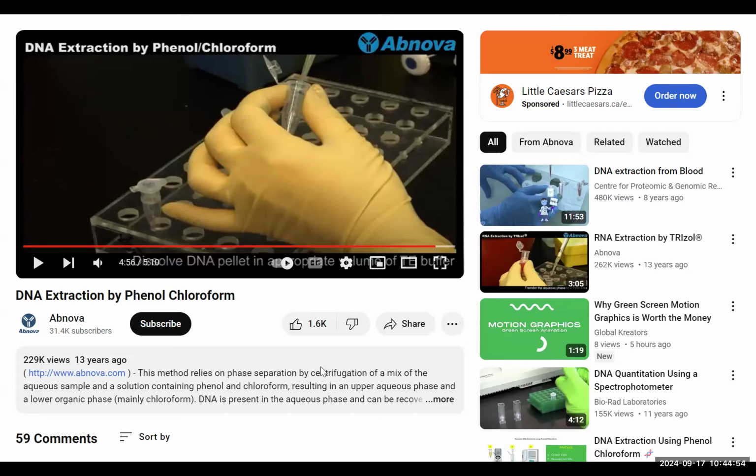So the non-ionic, I think in this condition, most of the time we either use NP-40 with a very little amount of SDS. I agree with you. Most of the time we use those. In the next couple of slides, I have some more examples, which will show you some protocols where we can separate all proteins, RNA, and DNA.